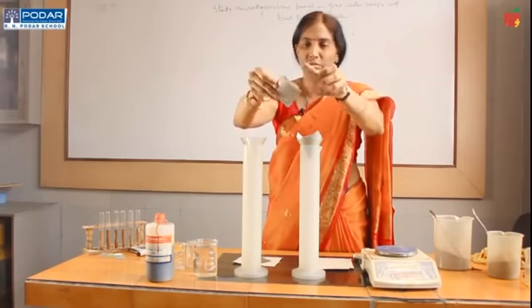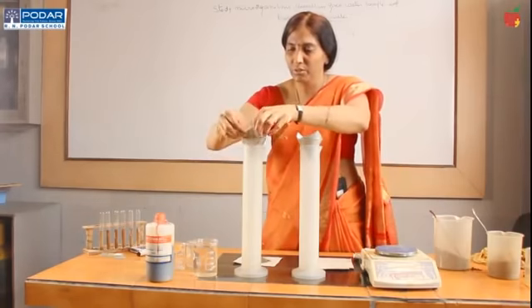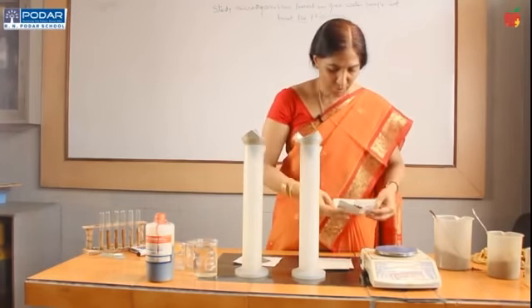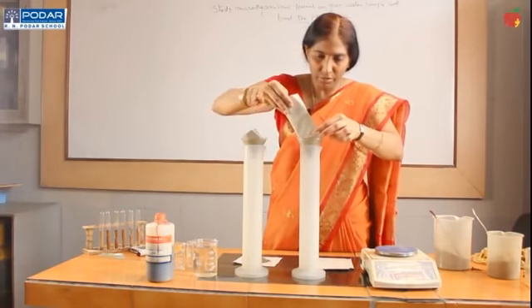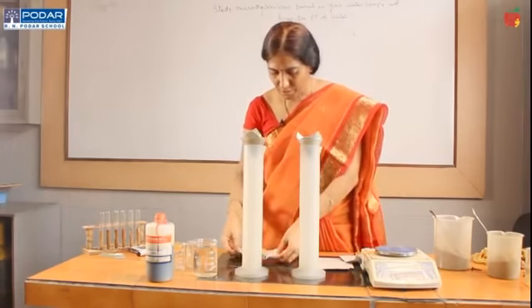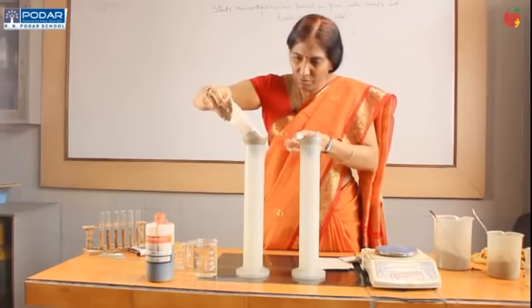So, this is the funnel now, dipped in water so that it will stick to the walls of the funnel. Now, I am carefully pouring garden soil into this funnel, and roadside soil also into this funnel.